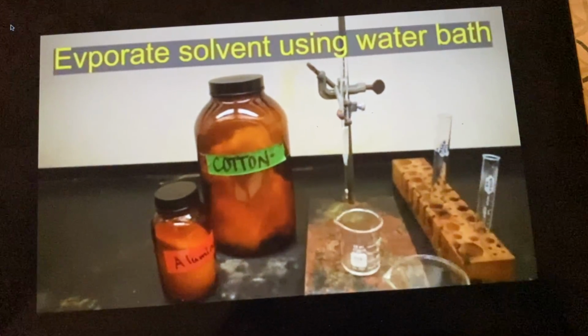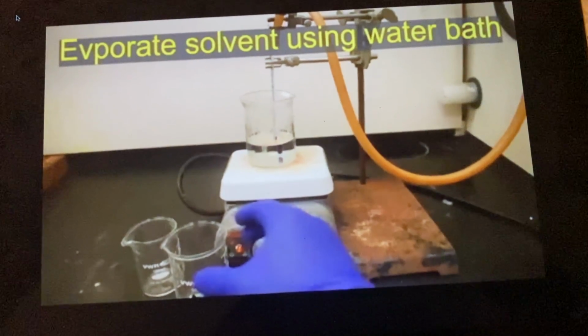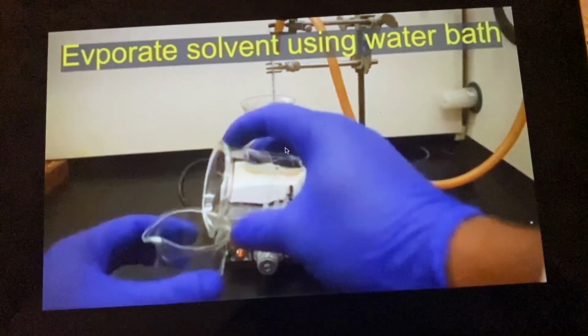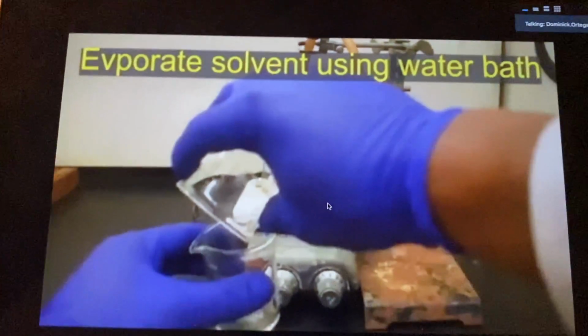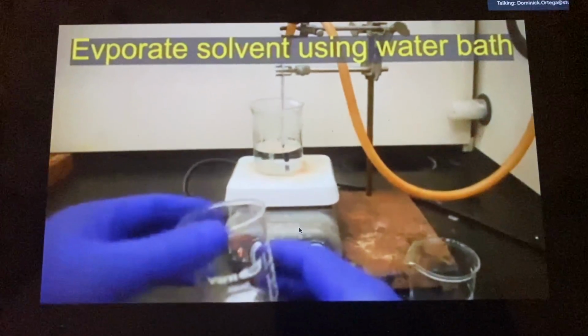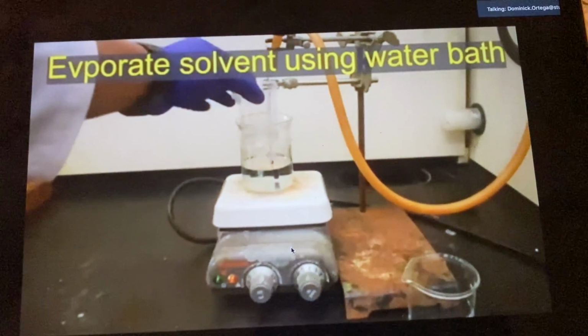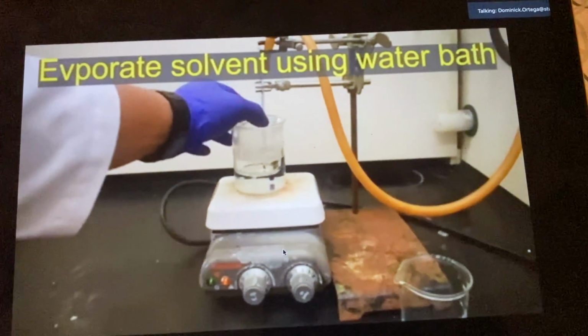Now the solvents that you collect with your active ingredient, you're going to evaporate the solvent. Typo right there. You're going to evaporate the solvent. Again, this is where I mentioned using a water bath or a heating plate. And then while it's evaporating, you also cool it to ensure crystal formation.